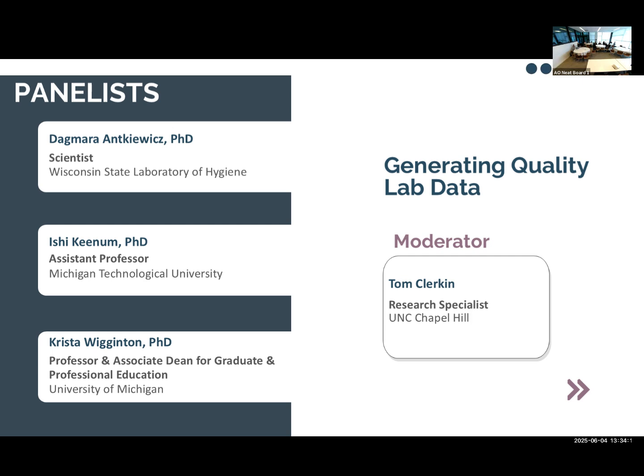And I was involved, so Ontario province did a lot of proficiency testing historically in Canada, and I was helping with their technical advisory, what do we do with all this data and how do we think about it? And one of the things that came out of that, Alex Chick is leading that, he's wonderful. One of the things that really came out to them when I was working with them was the time, so changing the method actually caused way more problems than picking a method and getting good at it. The time that a lab had been doing the same thing reduced their variability much more than trying to pick the best method and constantly tweaking every single thing every time.